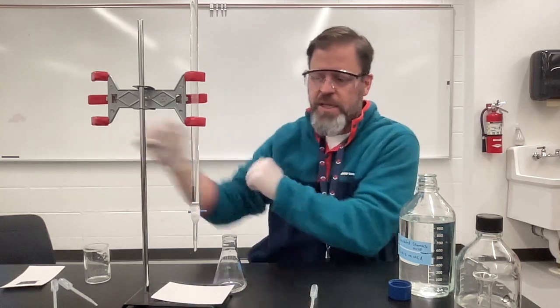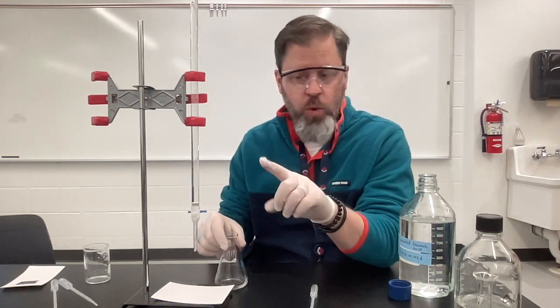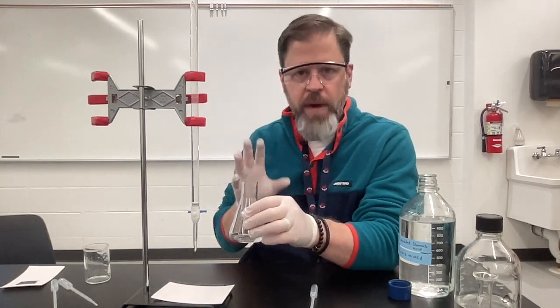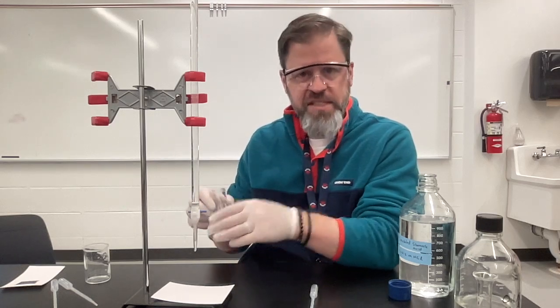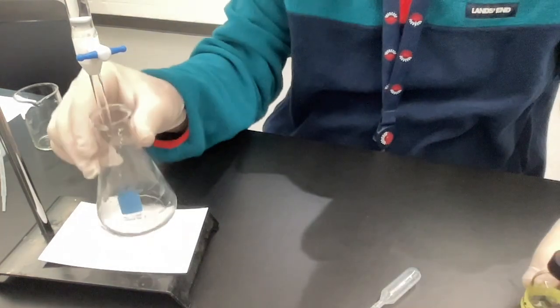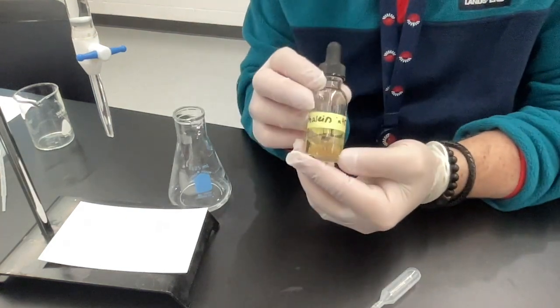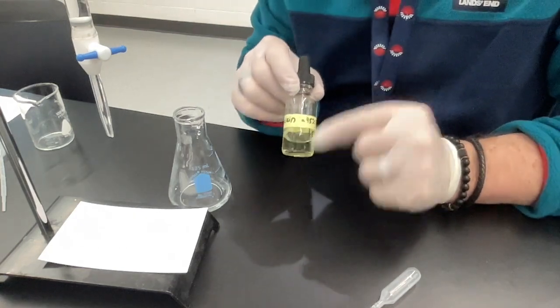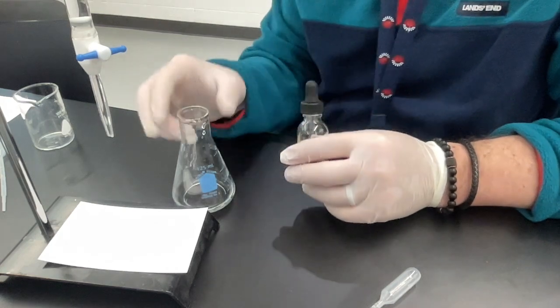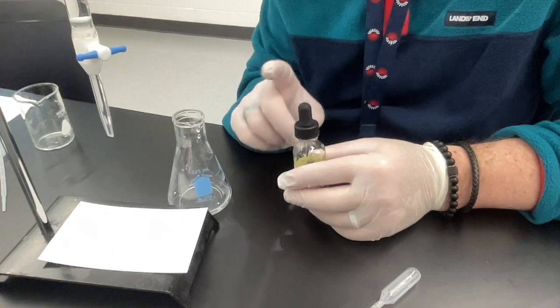If you understand the titration, I have put some number of moles of sample into here, and just because I rinsed with deionized water doesn't mean I'm adding more moles of the actual sample. So even though that volume creeps up a little bit from the rinse water, it's not influencing my actual data. Now I'm going to add my indicator. We're using a very common pH indicator called phenolphthalein. This is going to turn from a clear color under acidic conditions — and this is quite acidic right now — and it's going to turn pink under basic conditions, which will happen when I've added a sufficient amount from my burette.